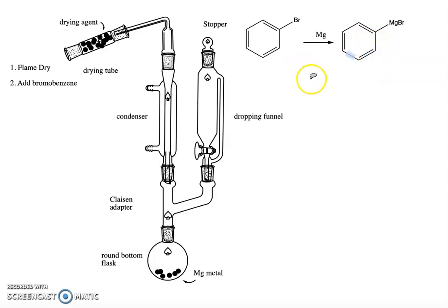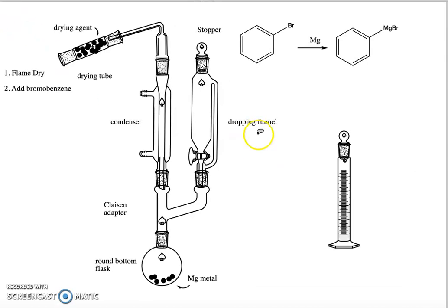In order to do that, we have to add the bromobenzene to the dropping funnel. We need to get it to the dropping funnel while exposing the system and the chemicals to as little moisture as possible. We're going to go to our reagent area and fill our dry graduated cylinder with the bromobenzene and make sure it's stoppered.